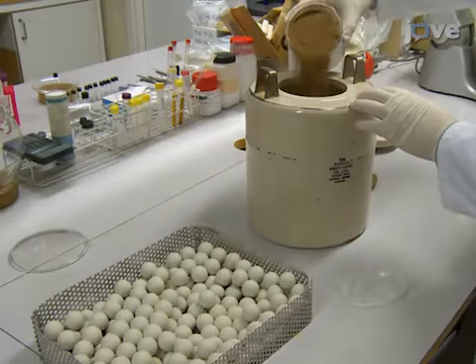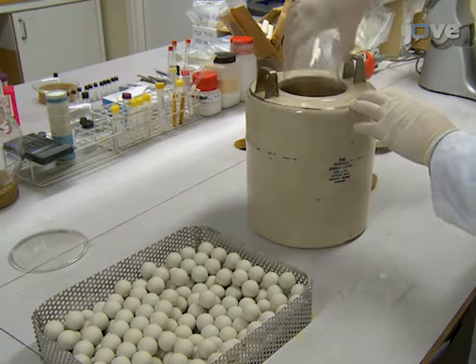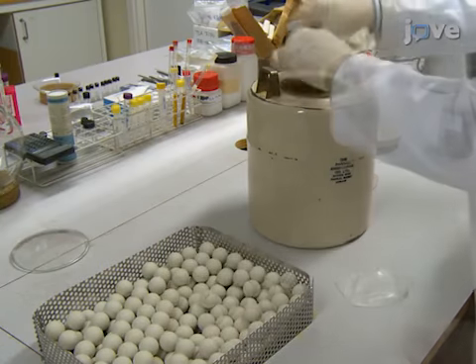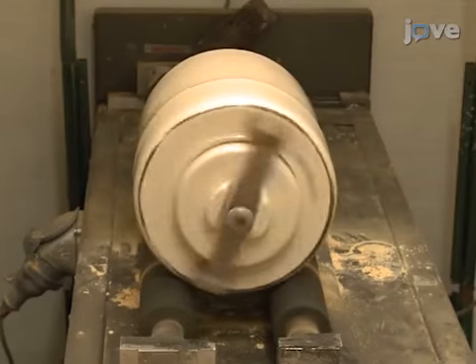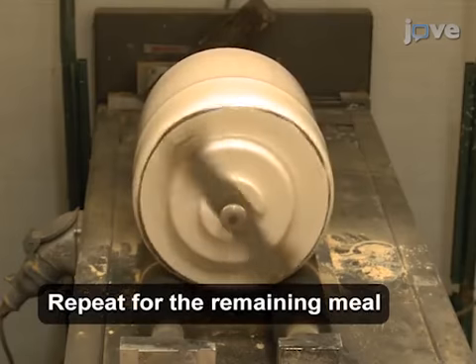Mill 250 grams of the Crambe meal at a time by placing it into a 7-liter jar along with 215 25mm diameter ceramic balls. Set the revolution rate on the milling machine to 53 RPM and mill the meal for 24 hours.